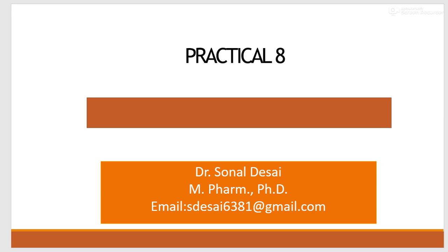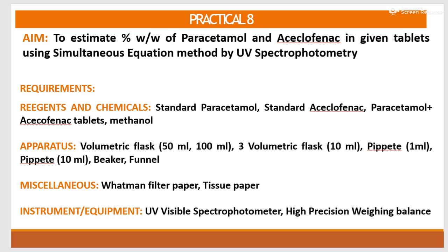Today we will discuss practical number 8, that is estimation of paracetamol and aceclofenac in given tablet by simultaneous equation method. So the aim is to estimate percentage weight by weight of paracetamol and aceclofenac in given tablets using simultaneous equation method by UV spectrophotometry. Requirements, reagents and chemicals.